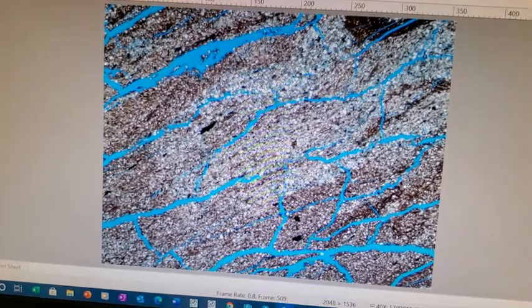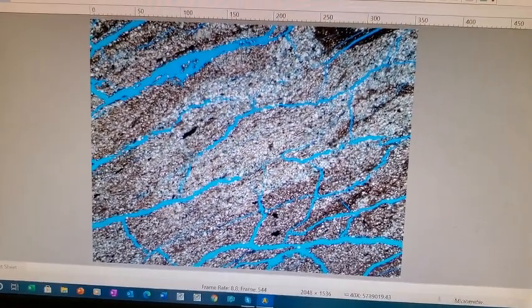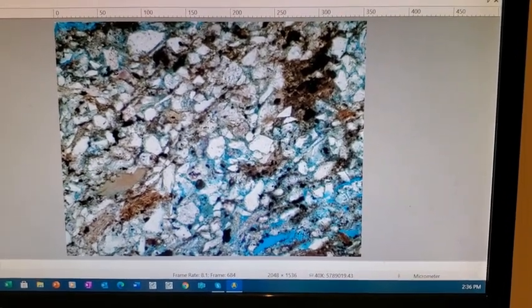I'm going to try to see whether I can show you a larger magnification. I am going 200 times now. And I'm trying to focus it. There. And you're looking now at a small portion of this thin section. I'm going one magnification higher. This is 400 times.